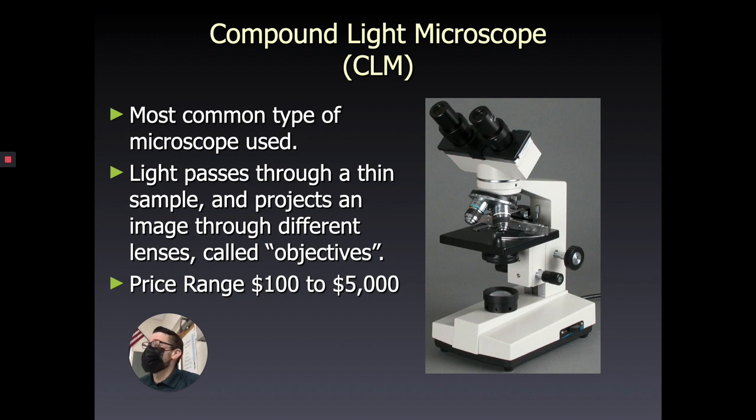Well, compared to some of the other microscopes we're going to see today, yeah, that is on the less expensive end of the scale. But the other reason why these are very common types of microscopes is because they're relatively easy to use. Every year I teach a classroom full of students how to use these microscopes in about 20 minutes. Like anything, it takes practice to get good at it, but I can show you the basic workings of a compound light microscope in a relatively short amount of time.